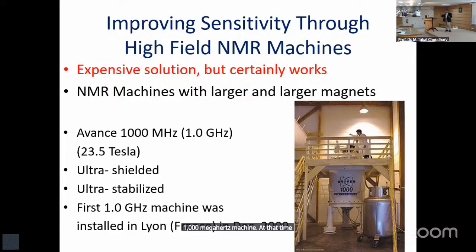Why the size? Because if you have a large magnet, you need to have more helium and more nitrogen. And you need to actually go stairs up, or you make a ditch and put it down there. But the best method is this one, where you always have a problem of water seepage and many other things.